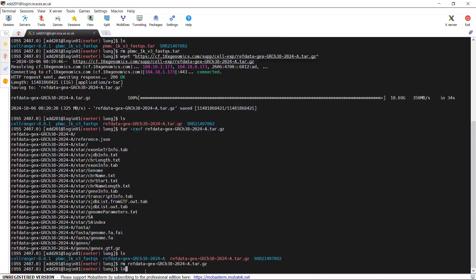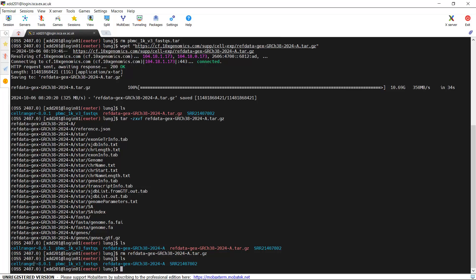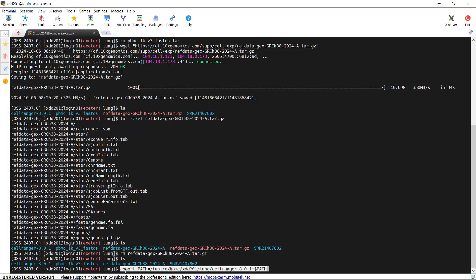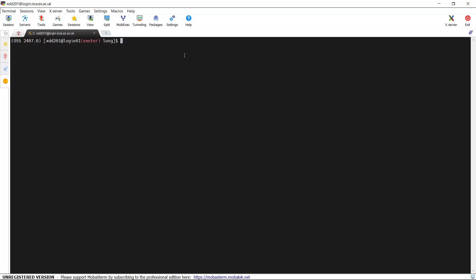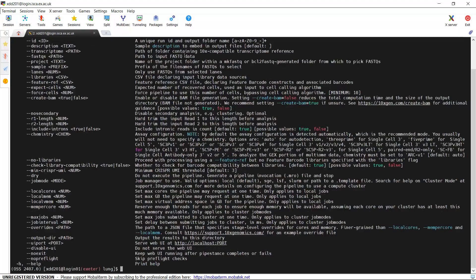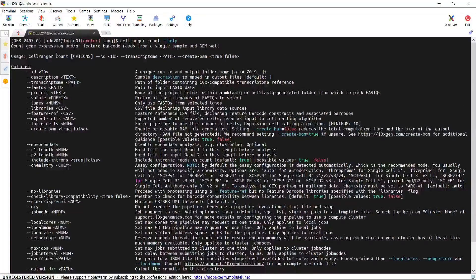Let's review what we have. We have Cell Ranger installed, the PBMC 1K raw sequencing data, and the human reference genome, all saved in the same home folder. First, we can export the Cell Ranger path using the export function. Let's clear the screen, then use the help function to have a look at all the arguments available in the Cell Ranger count command.